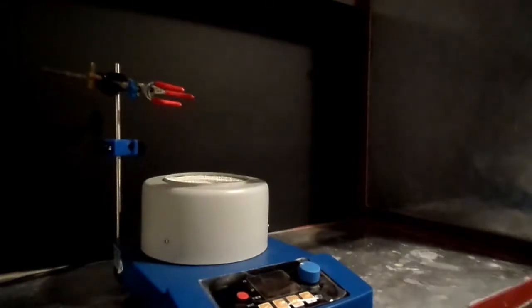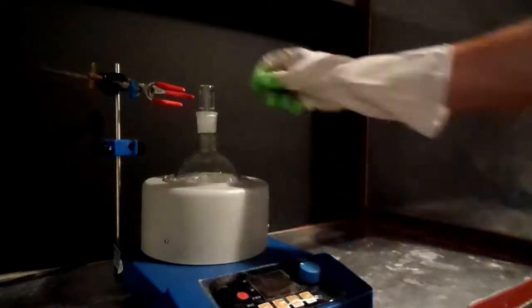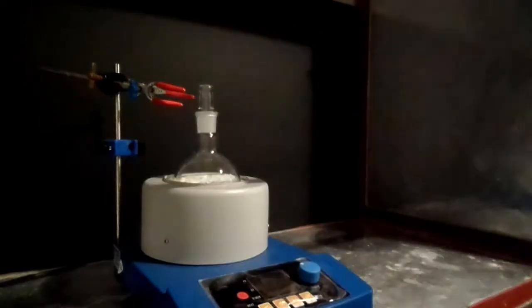Both dried reagents were then added into a 500ml round bottom flask along with a stir bar and placed into a heating mantle. The flask was then set up for simple distillation.